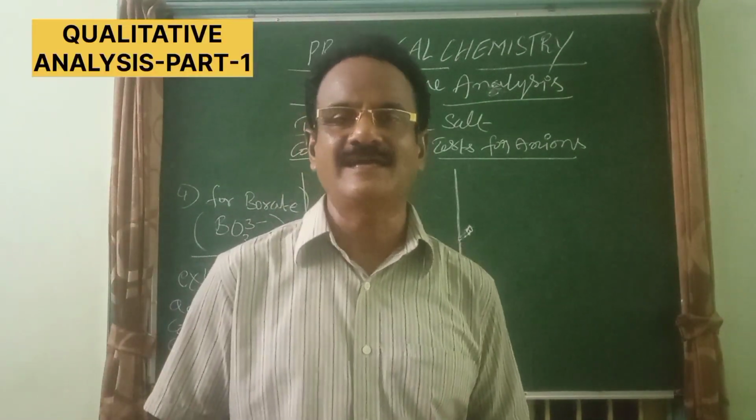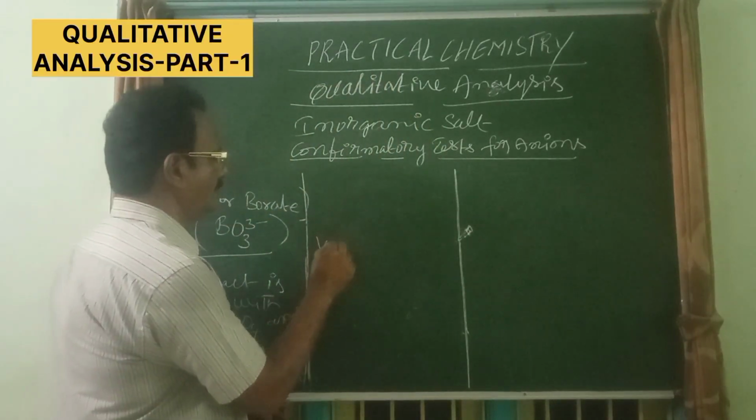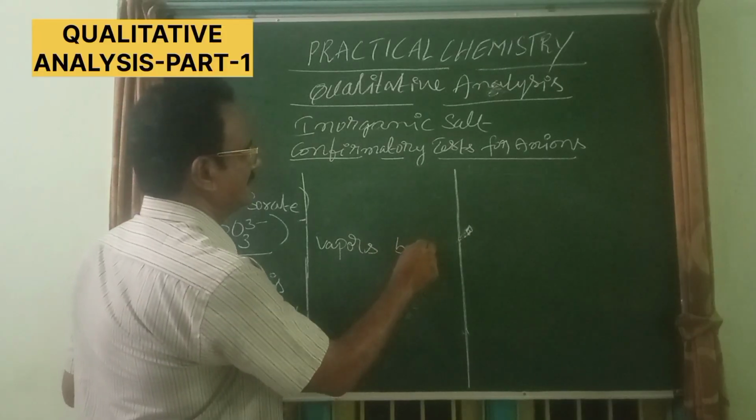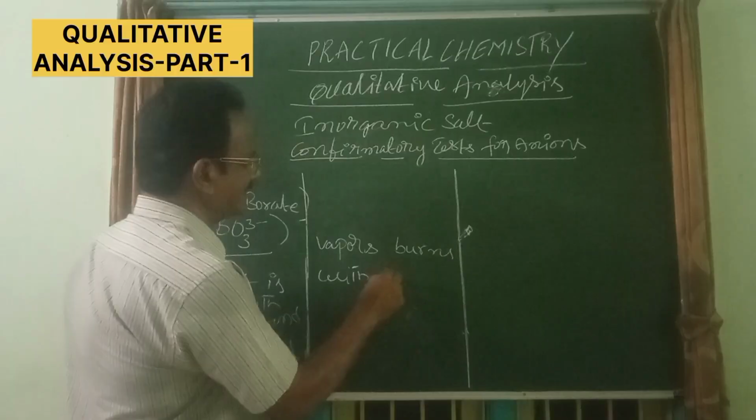Okay, that is the confirmatory test for borate. The vapors burn with green color.